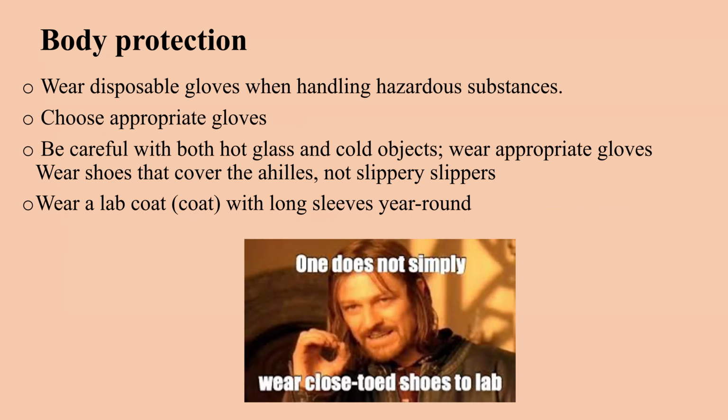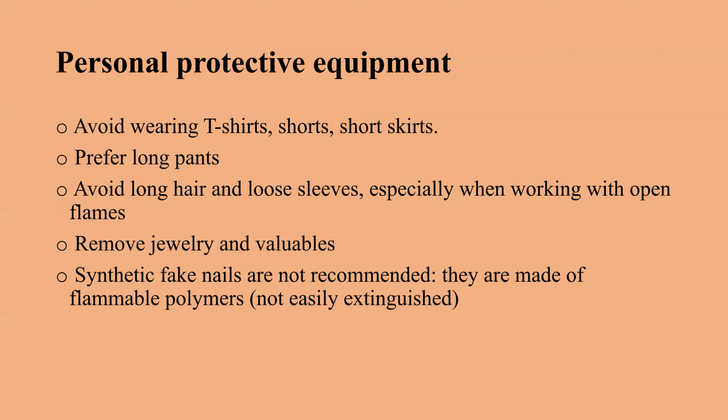Returning to personal protection, change gloves and use appropriate gloves, because gloves have different thickness and different material, etc. And shoes should cover the heels. They should not be slippery shoes. And the lab coat helps us if we contaminate ourselves with some chemicals. This coat is very easy to change.